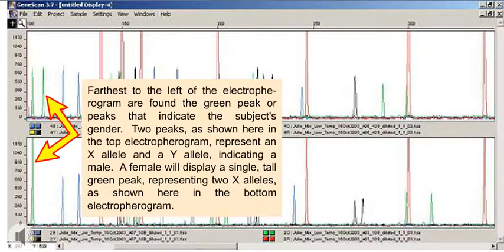Farthest to the left of the electropherogram are found the green peak, or peaks, that indicate the subject's gender. Two peaks, as shown here in the top electropherogram, represent an X allele and a Y allele, indicating a male. A female will display a single, tall green peak, representing two X alleles, as shown here in the bottom electropherogram.